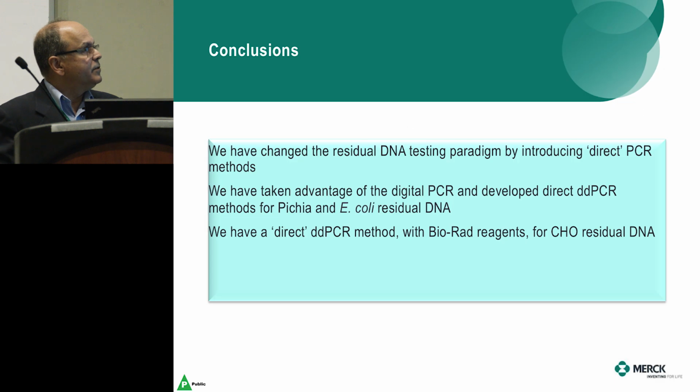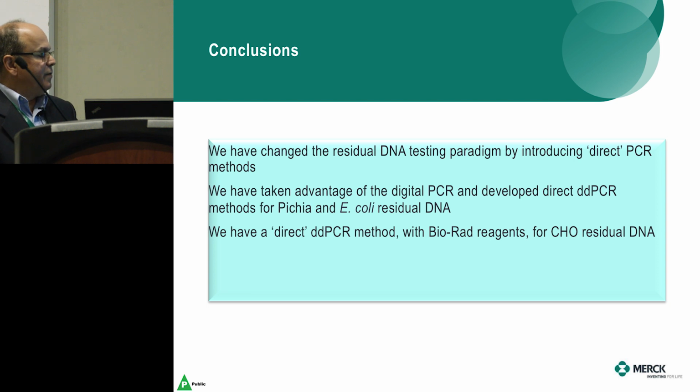We have changed the paradigm, which is a simple thing to do: let's not extract the DNA and be able to test directly. We have used digital PCR, and basically that's it.